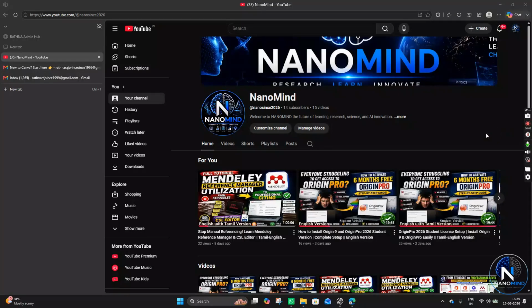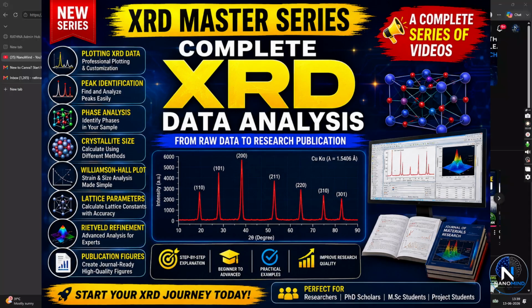So today I'm going to show you a new series, a number of videos about XRD analysis and everything about XRD plotting, how we need to plot attractively. So it will be very attractive in articles, and whatever XRD analysis, like phase analysis and Rietveld refinement analysis, and how we need to match our data with the previous XRD data. So like this, everything we are going to learn after this in this XRD series.